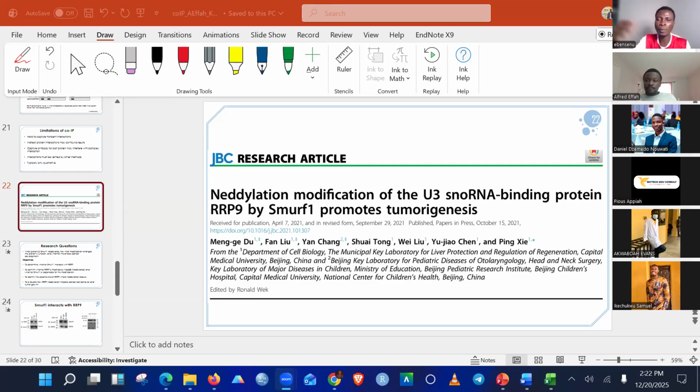So the location and movement of these different proteins will also help you see that this protein interacts with that protein so that they move together to a certain place to work. So you have to study the role or the location of different proteins, how they are working. Then you process those hypotheses: because this protein is moving this way to here, and this is serving as a police, you want to see whether it's assisting this. Then you have to propose this IP as one of the research methods.